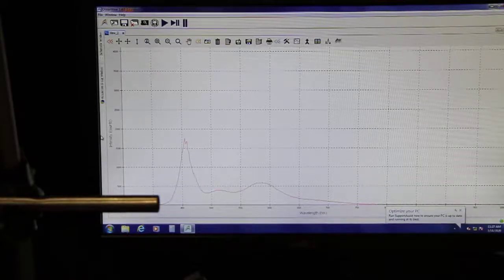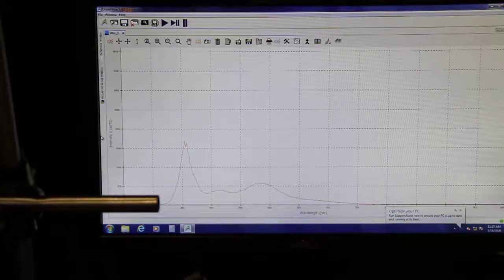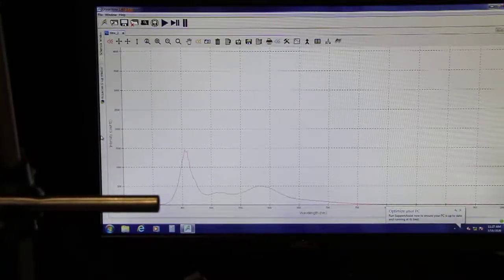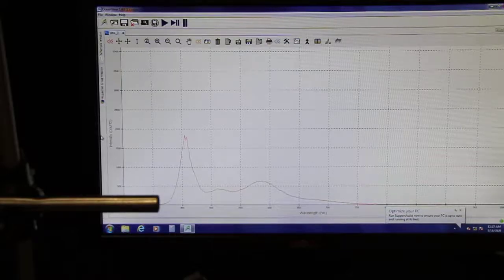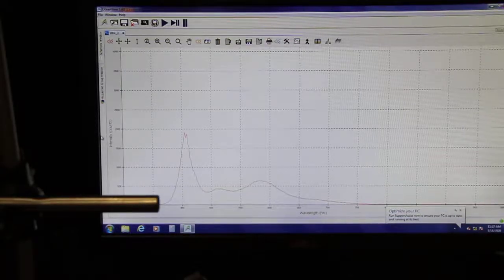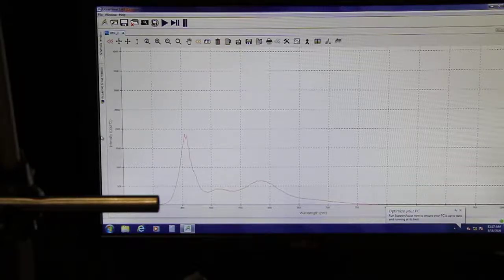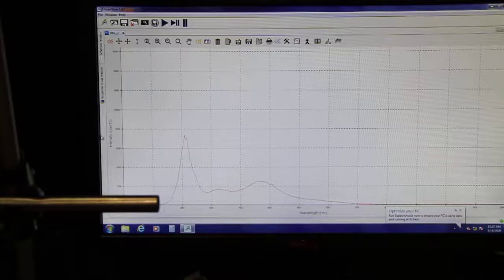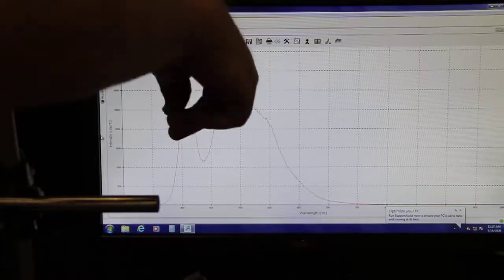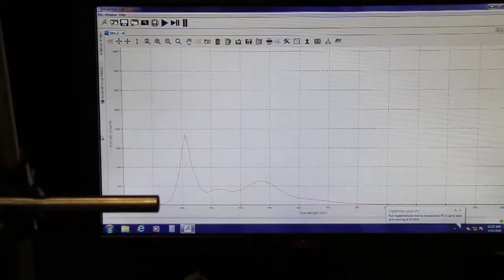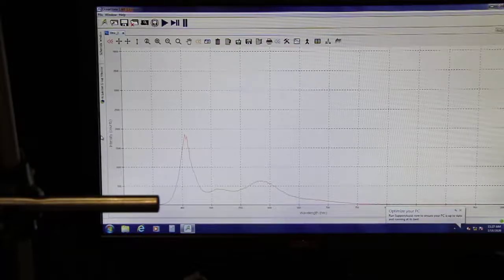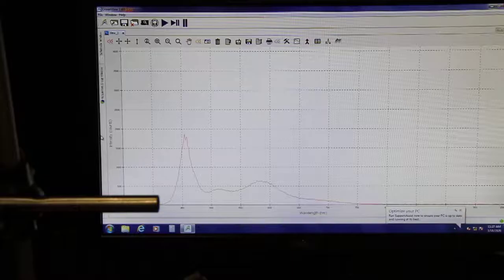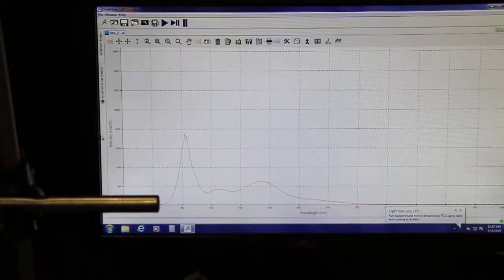What do you see? There's really two peaks now. There's a peak in the middle, but that just corresponds to the white LED, right? The one in the middle kind of corresponds to that. But what do we got? Where are the two real peaks? The two peaks, what colors do those correspond to?